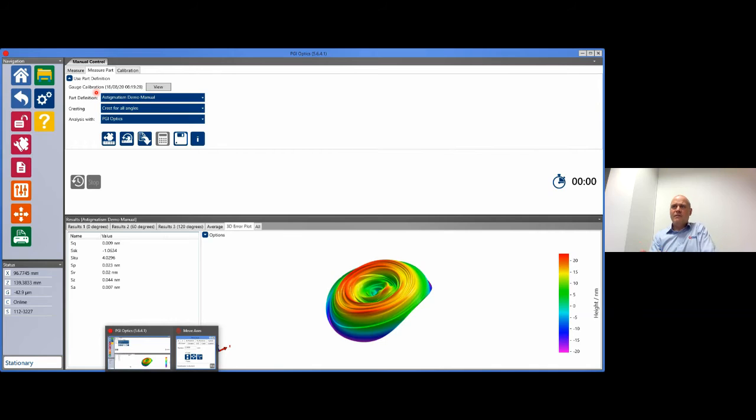Now, once you've got that surface, we automatically save that surface as a text file, so you can use that 3D residual surface should you want to for something else, like doing corrections, etc. Or in this case, as I'll show you in the next few slides, it's really moving on to how you could do a more advanced analysis on it. For example, Zernike.